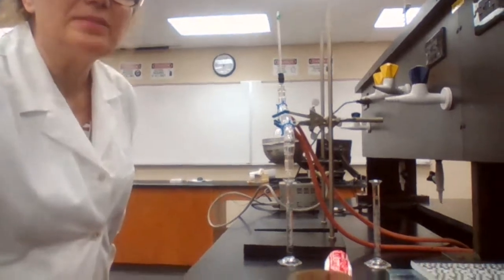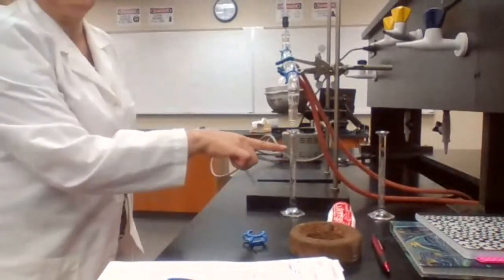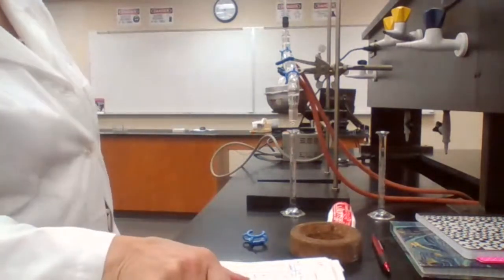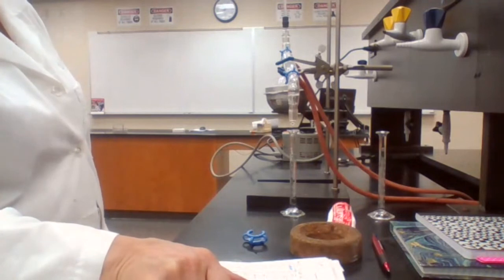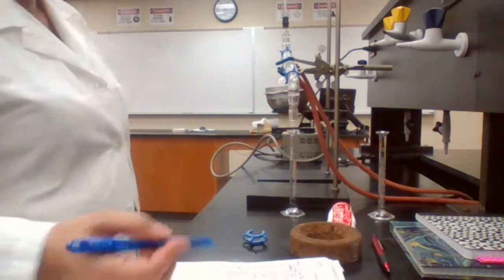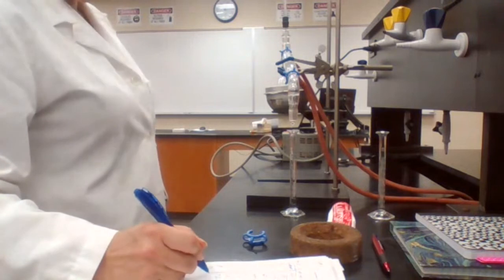Do you see the setup now? The dripping and the volume being collected? Yes. Okay. 9 milliliters, 73.